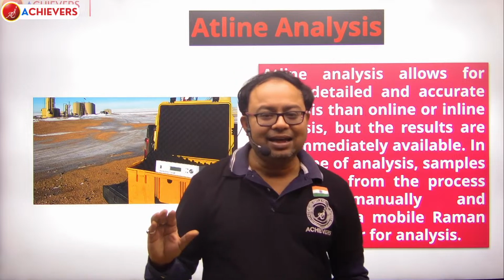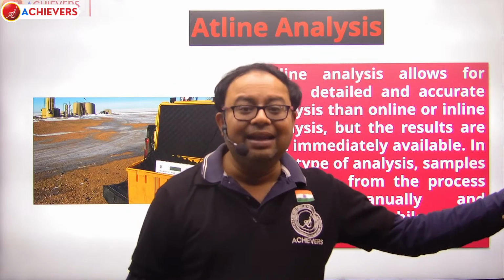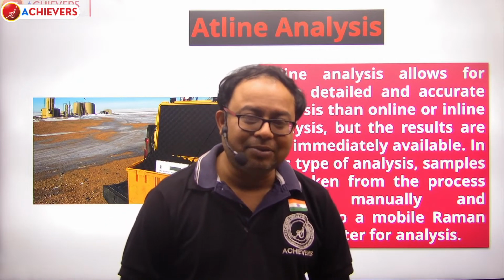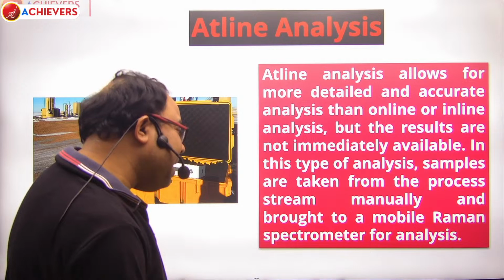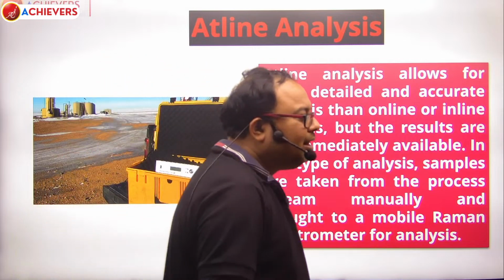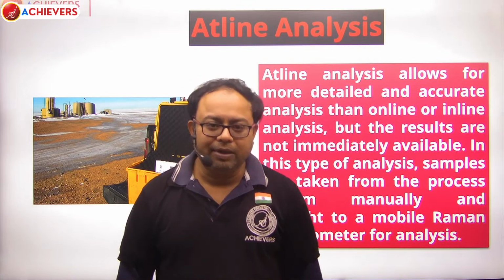Of at-line analysis. In at-line analysis, you will be getting what? You will be getting more precise and accurate data in context to your inline or online analysis. But there is a con also associated with that process, and that con is it's very much time consuming. Okay. In this type of analysis, samples are taken from the process stream manually and brought to a mobile Raman spectrometer for analysis. That's the sole reason why it's highly time consuming.